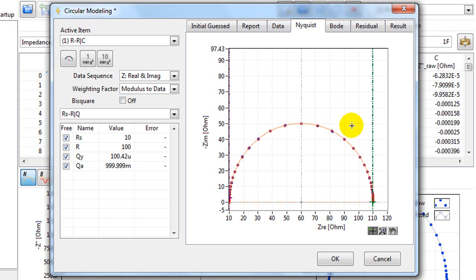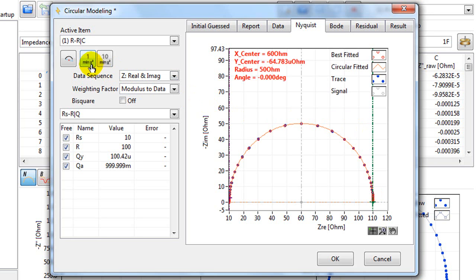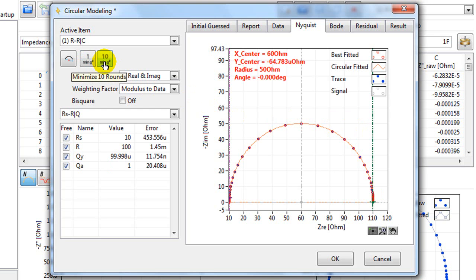You're now ready to do modelling, so you click either on the one time or ten times modelling. And the software calculates these values.